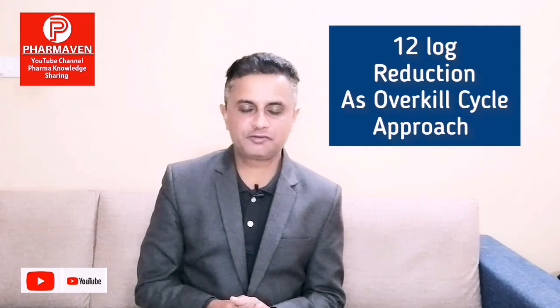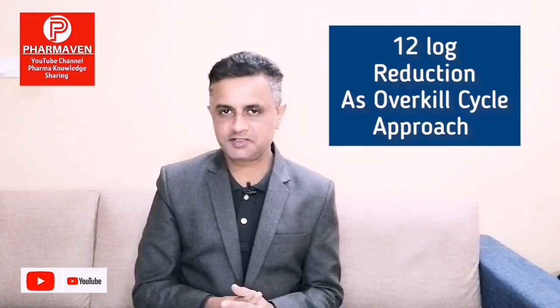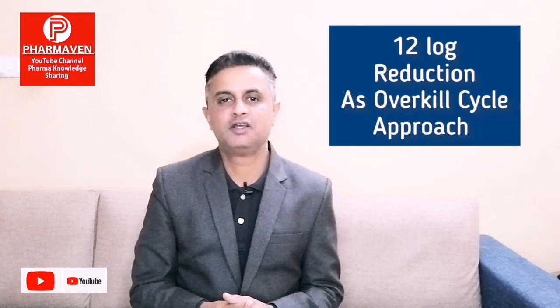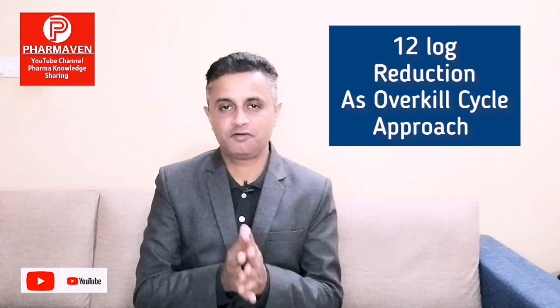So what is overkill approach cycle? For example, if my population is 10 power to 6, if my D value is 1, then a 6 minute cycle at 121 will reduce the bioburden to the required level, it will achieve 6 log reduction. However, in order to achieve overkill approach, normally the time is doubled. For example, if my F0 value is 1, my BI's population is 10 power to 6, then 6 minutes is sufficient, but they'll go for the 12 minute cycle, that is 121 degree for 12 minutes. So it will achieve 10 power to 12 log reduction of the BI.